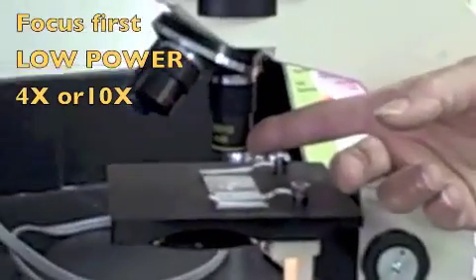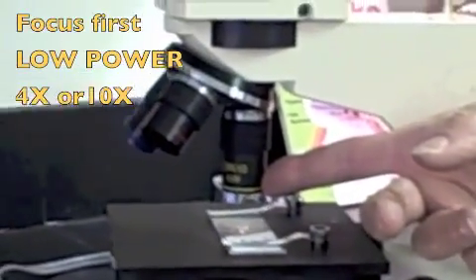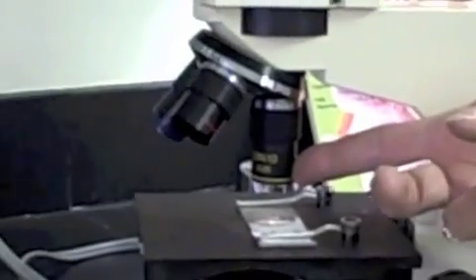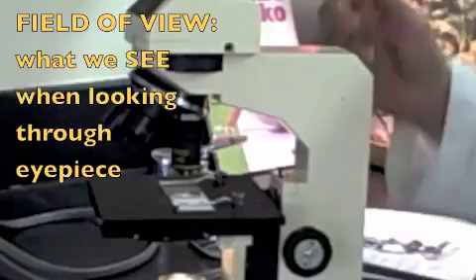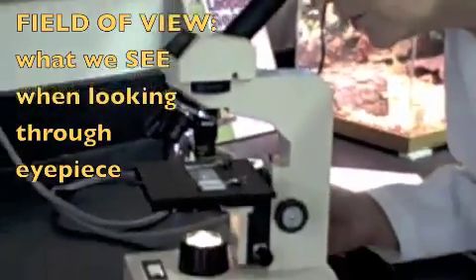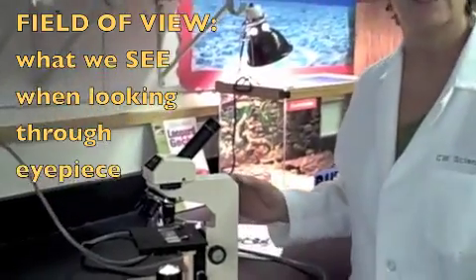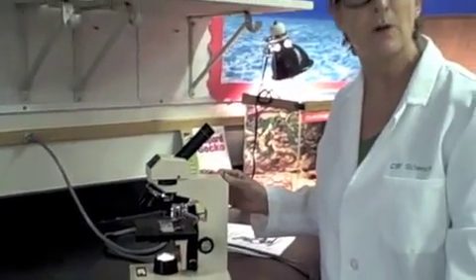Now, one reason we do that is because it has a very large field of view. What's the field of view? The field of view is what we see when we look through the eyepiece. When we're on low power, it's easier to locate a specimen because it looks smaller.